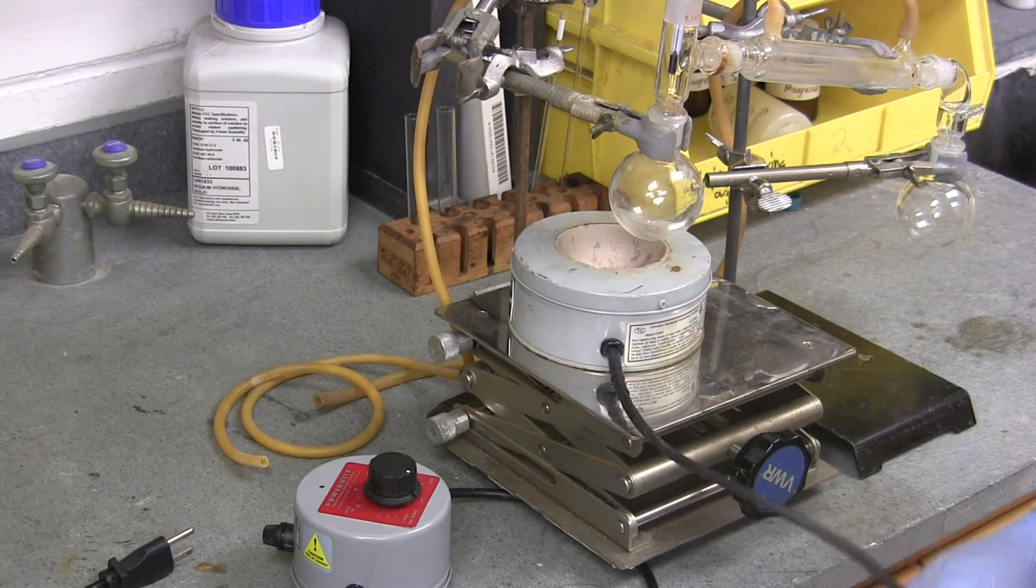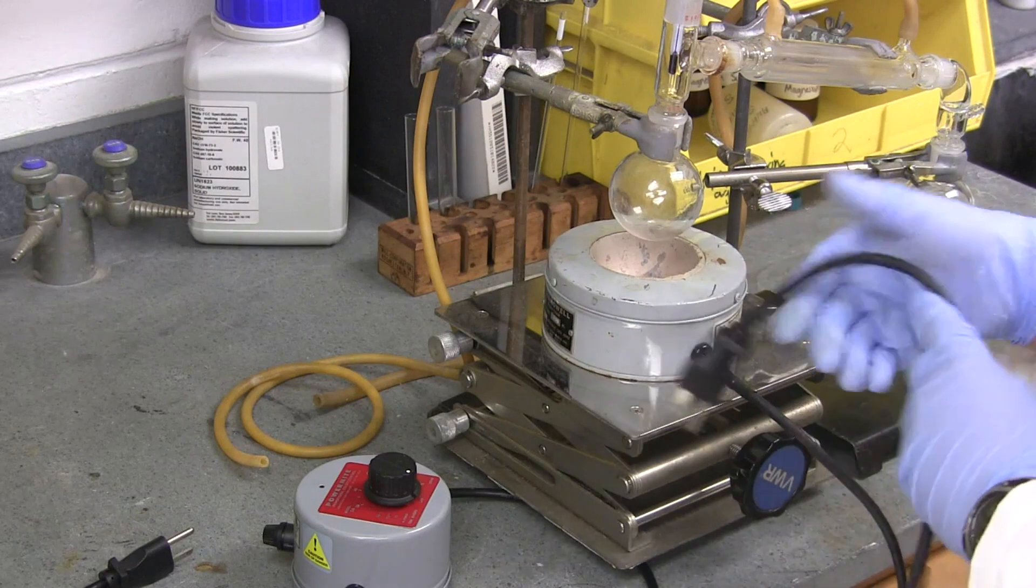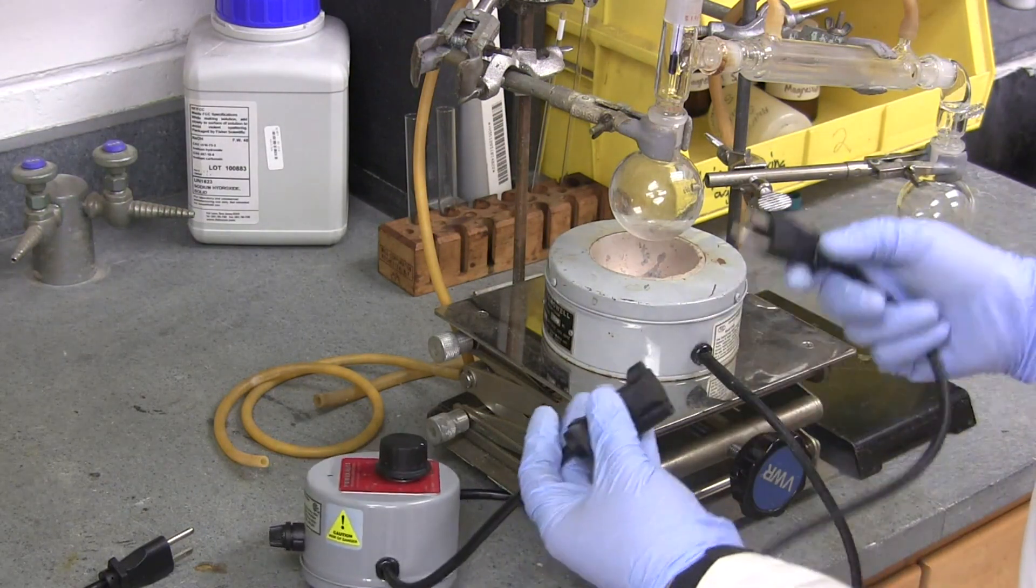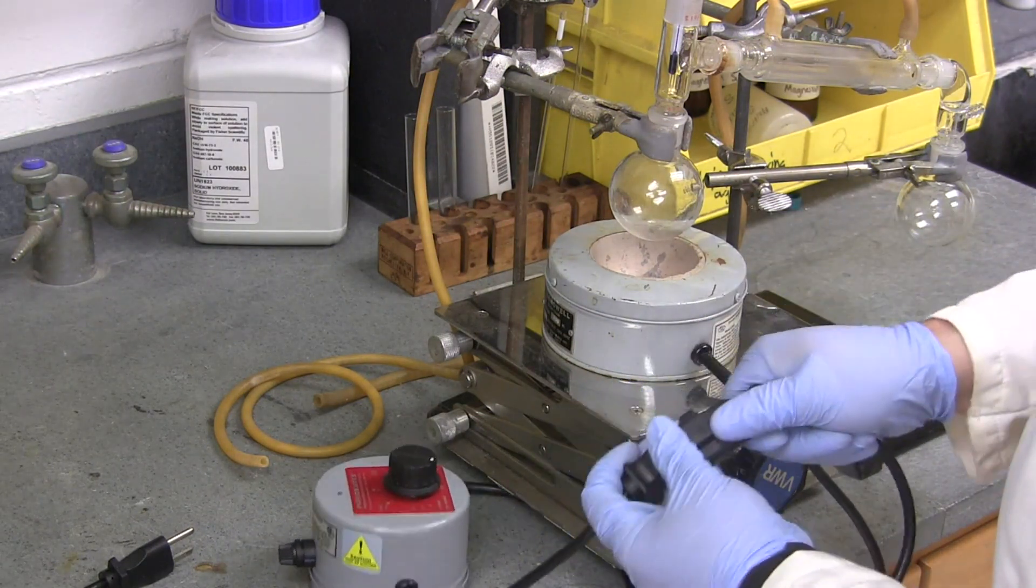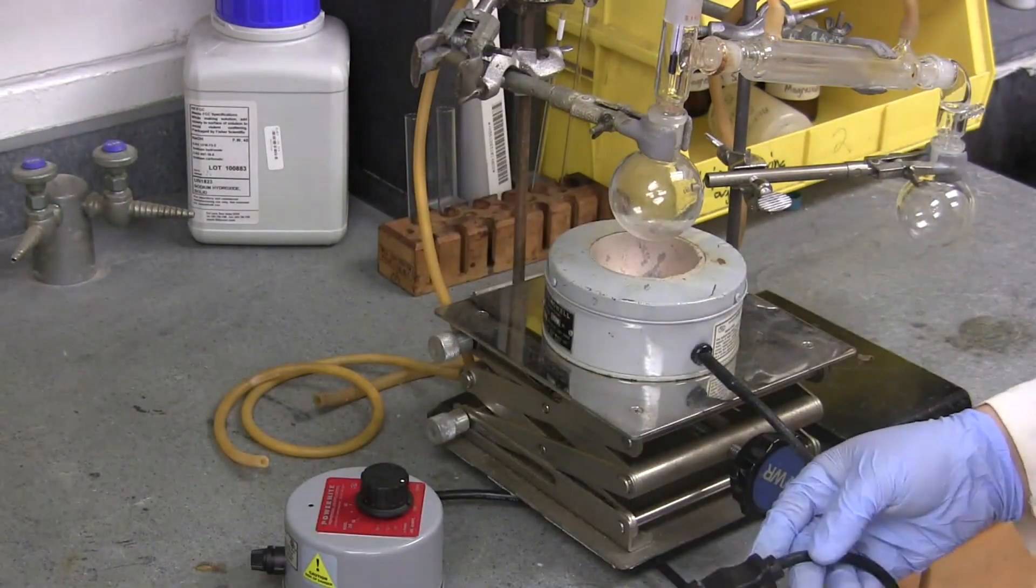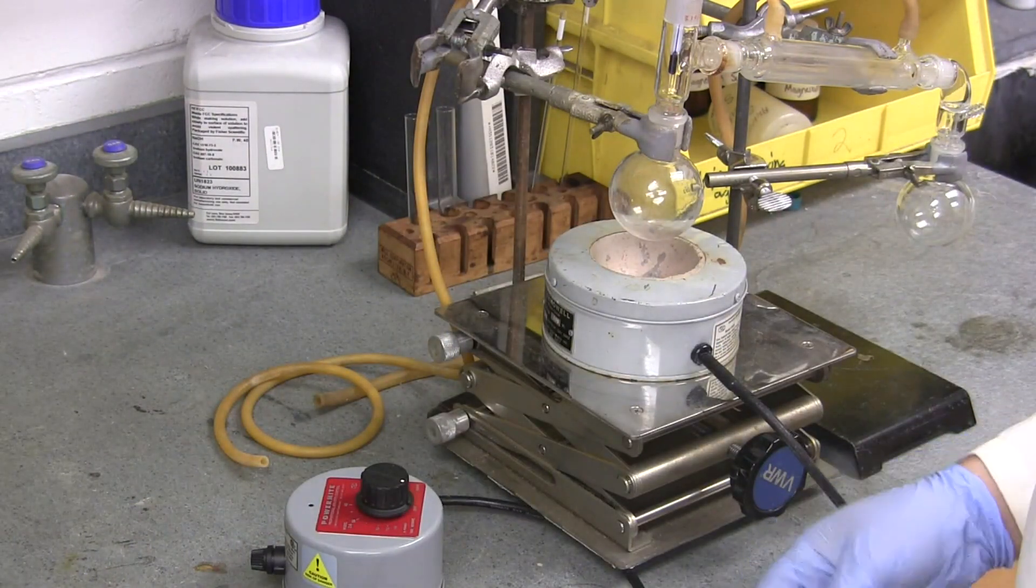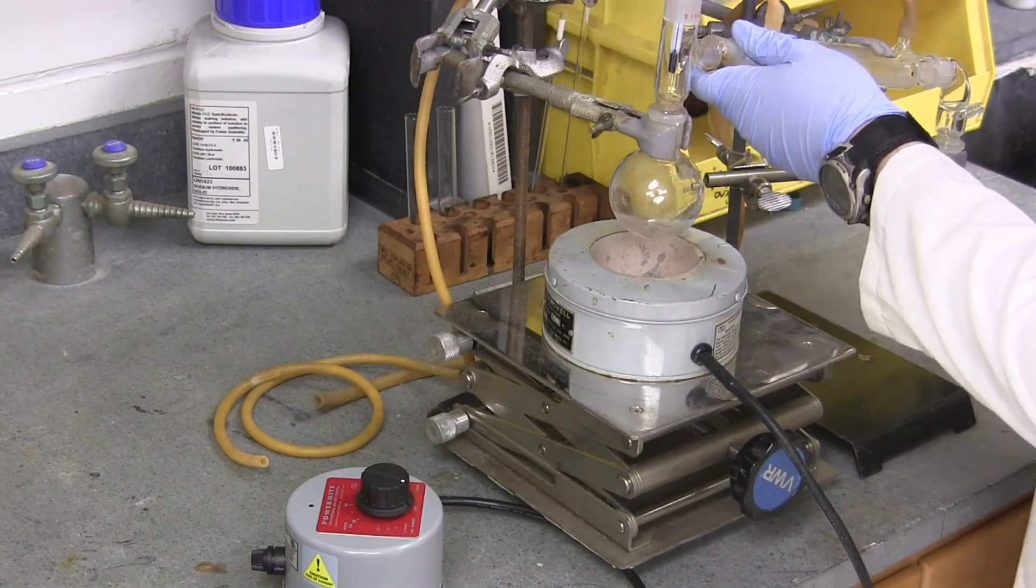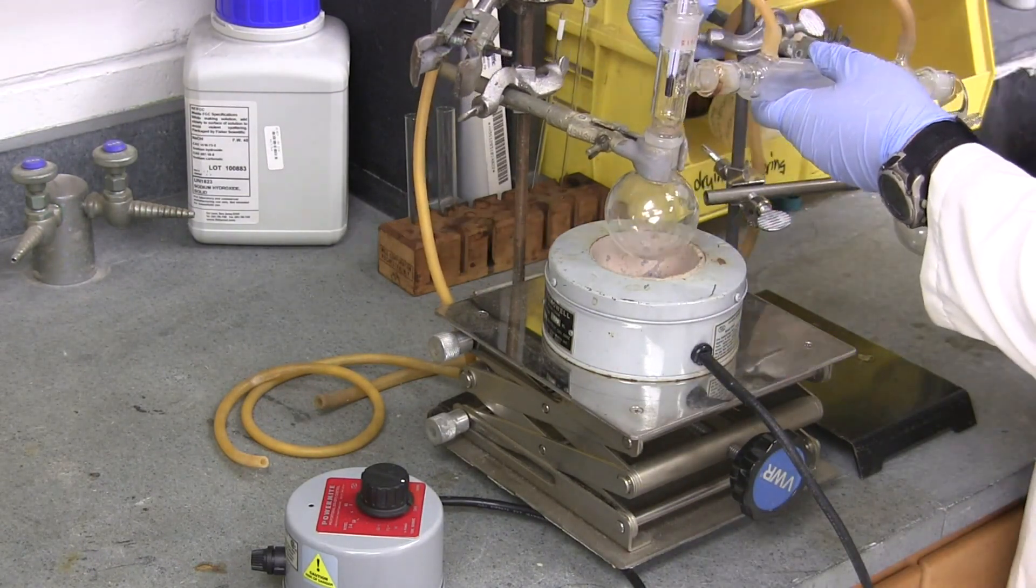For either setup, a heating mantle is used to heat the distilling flask. Simply attach the heating mantle to the dial and the dial to the outlet. The distilling flask is lowered into the heating mantle, and the distillation can begin.